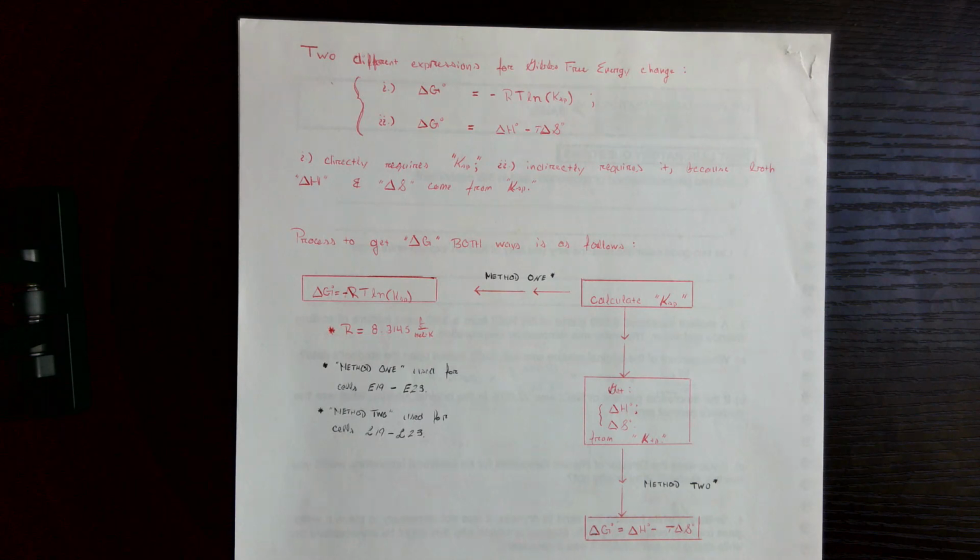The lab centers around determining whether or not a reaction of interest is spontaneous over a range of temperatures. In particular, the reaction, and I'm going to get to that in a second, is the dissolution of borax. And so what you are trying to do with this lab is determine whether for a series of temperatures the reaction is spontaneous or not.